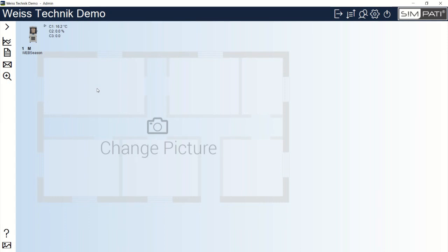Hello everyone. In today's video, we're going to go over the basic tutorial and basic features of the SIMPATI software so you can get up and running with it at your lab or facility.